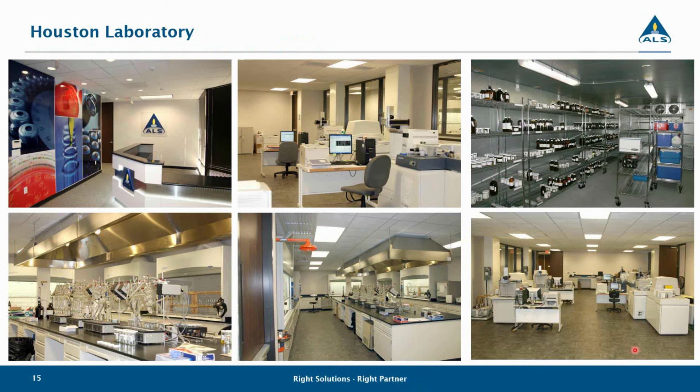They will be reported as non-detect because basically the two most abundant ions are not falling within the range you expect them to fall in. So they're expecting a certain percentage of those two most abundant ions, and when they fall outside of that range, then you're questioning that positive identification of the quantity. Even though you've positively identified the compound, you aren't as sure about the quantity because you may have some interference there with the same ion interfering. So that's why you would want to flag that data and report it as the EMPC.